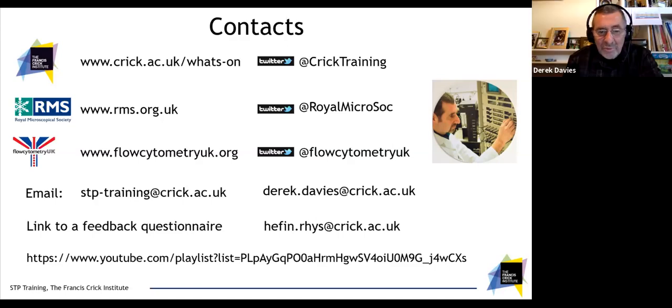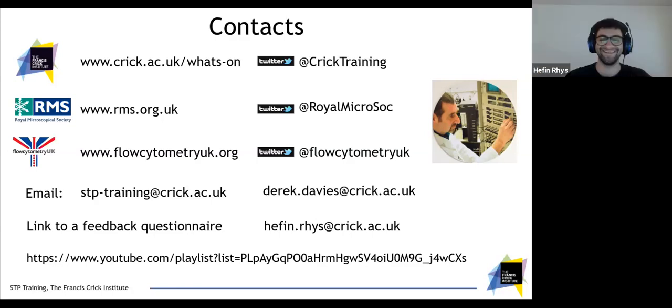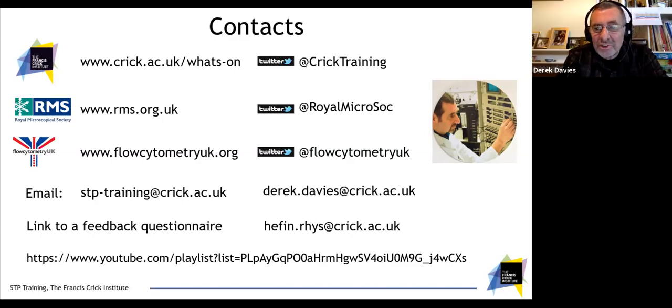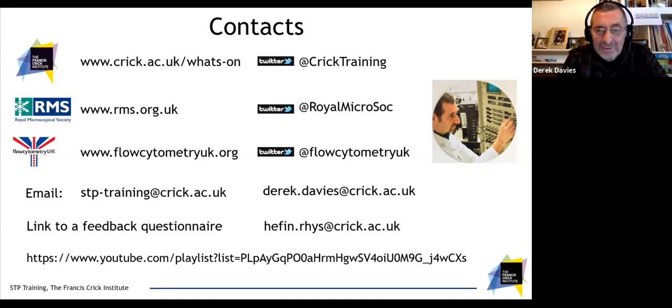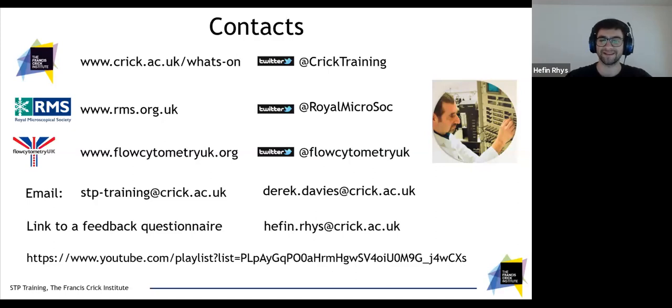I suppose one question that we always get asked with the ImageStream is, why doesn't it sort? I think the Luminex people are bored of us asking that, actually. I think it would be a mean feat for them to create an instrument that had the processing power to do that. You mentioned those simple sorters, and they are very simple, aren't they? They're microscopes that pick out one color, which is much simpler than the way this works. Sadly, we don't have an imaging sorter that is high performance like the ImageStream.